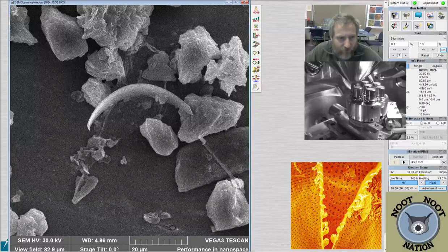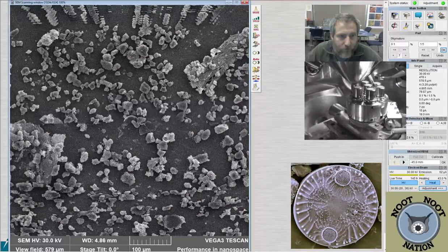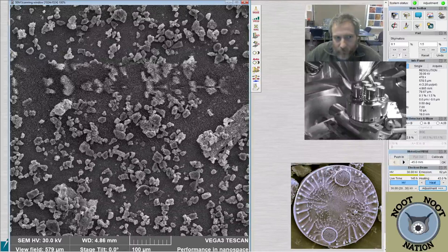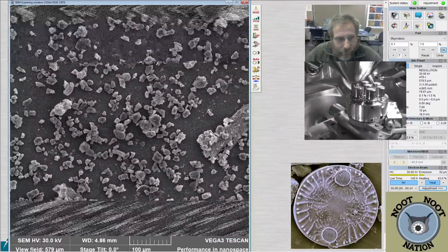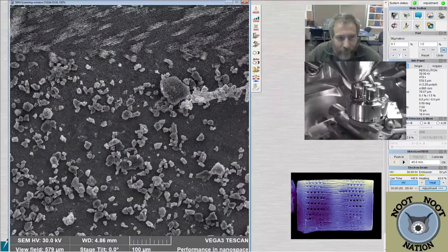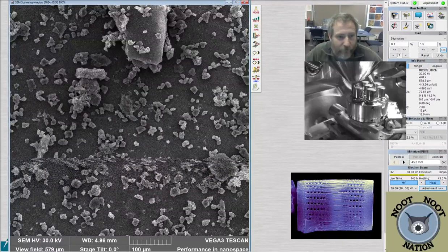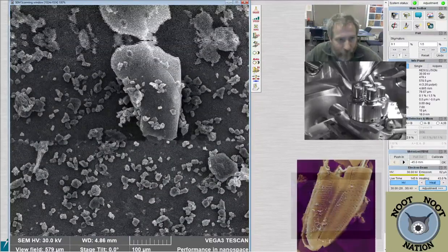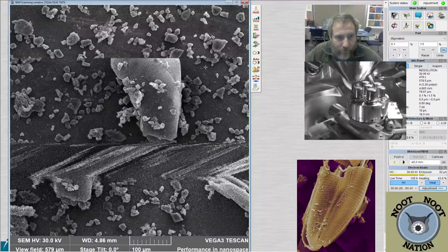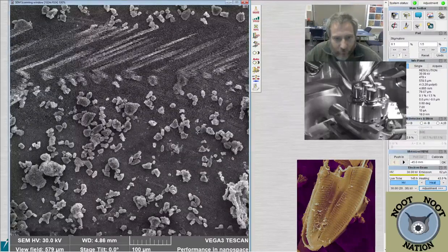There are some pieces of diatoms in here as well. Probably the most common diatom that we find in the Wabash River is Cyclotella meneghiniana, and it's not very attractive. It's tiny, and I'm sure we'll find some if I browse around a little bit. It's a little tiny circular diatom in valve view, or drum shaped if you want. Think about it in three dimensions, and we see a lot of it. Probably that little Discostella that we saw in here will be pretty common. Here's another little round guy.